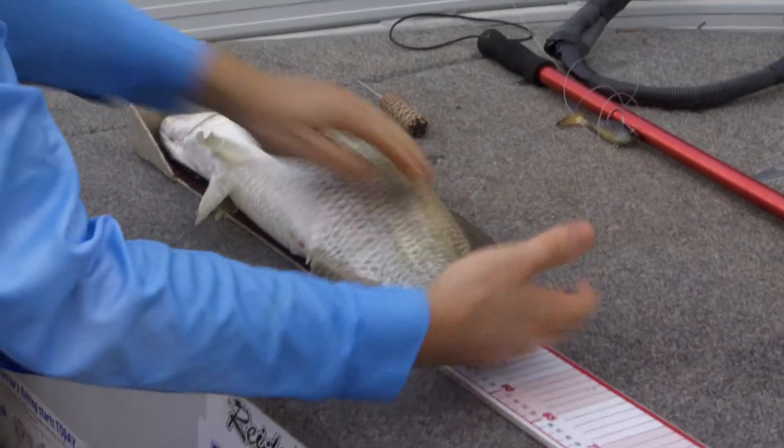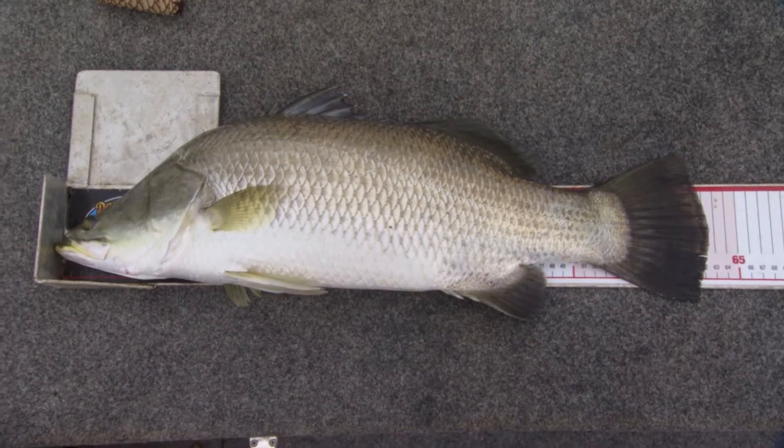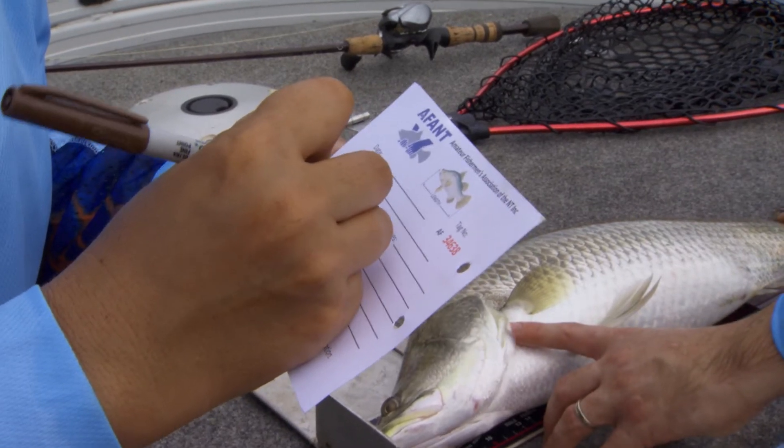Once you have a fish ready to tag, lay the fish on a measuring station and get an accurate measurement first. If you have a partner, have them record the length. This one's 62 centimetres.